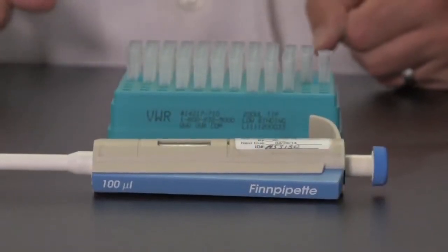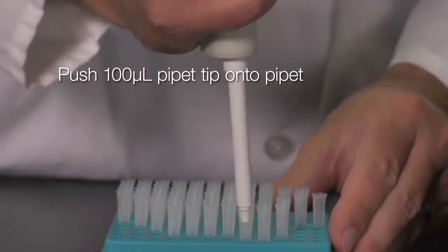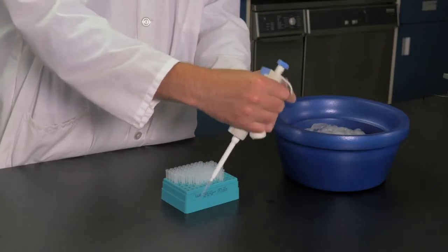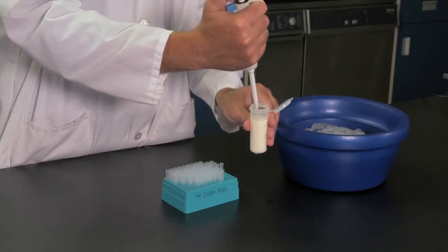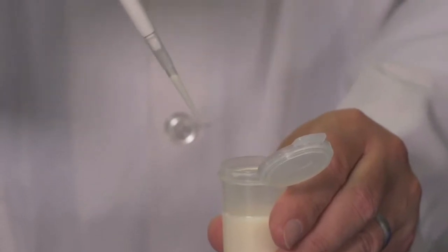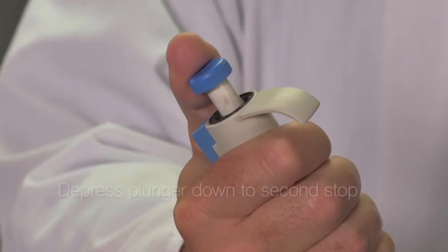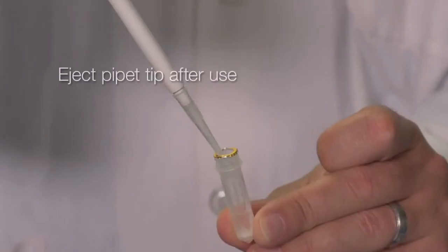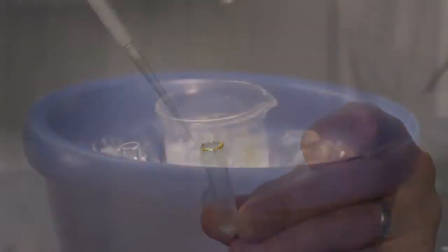These instructions will demonstrate proper use of a 100 microliter fixed volume two-stop pipette. Push the appropriate 100 microliter pipette tip onto your pipette. Press the plunger down to the first stop, then insert the pipette tip into the milk sample and slowly release the plunger to the original starting position. Check to make sure there are no air bubbles in the pipette tip. To expel the milk, depress the plunger slowly and completely down to the second stop to dispense the entire sample, then eject the pipette tip. Always use a new clean pipette tip for pipetting samples.